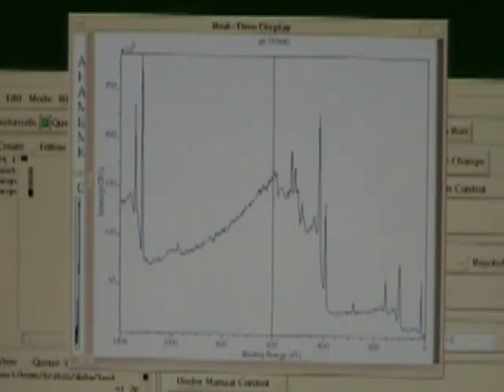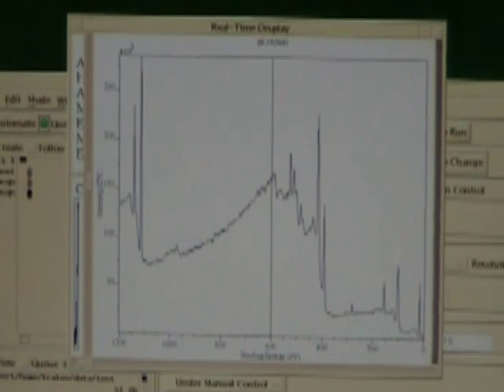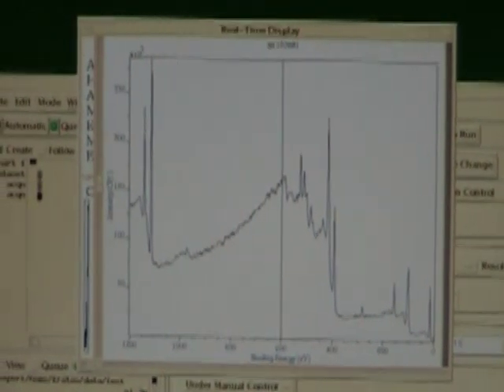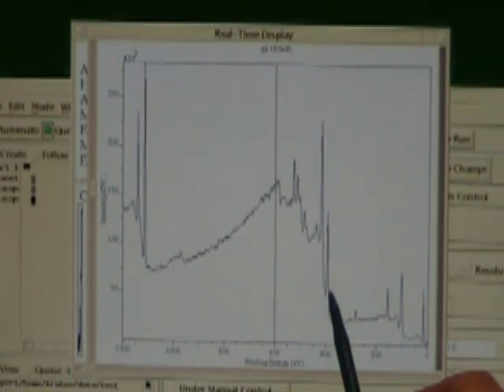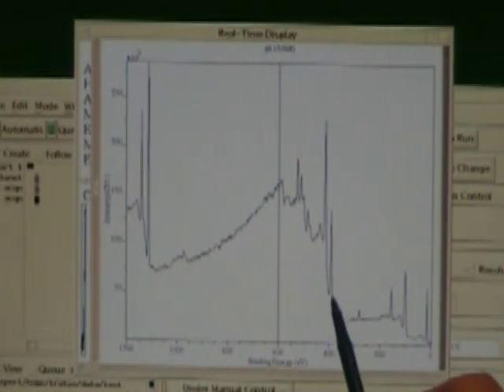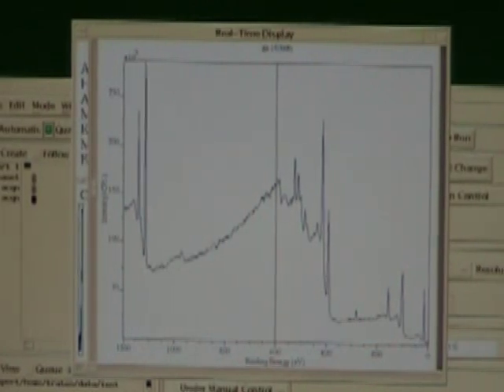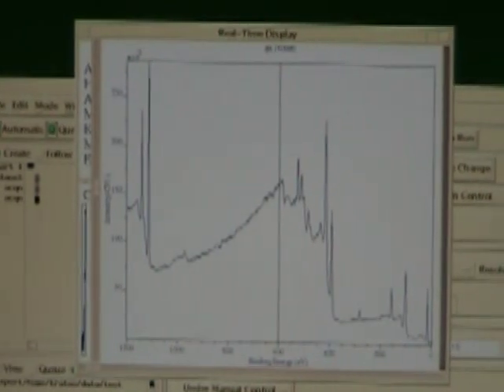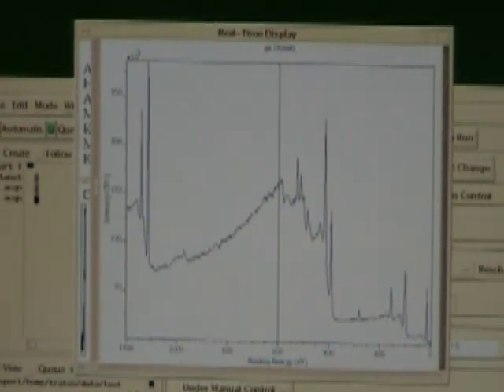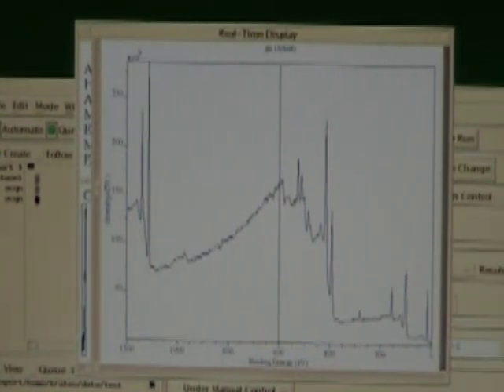We can tell whether the gallium is in one or more bonding states. We'll take a look at this oxygen peak in high resolution and see how much of the oxygen is just sitting on the surface as H2O adsorbed or CO2 as opposed to actually bonded to the gallium. And then this peak here at about 400 eV is actually a combination of the nitrogen 1s photoelectron peak, which is what we're interested in, and the gallium Auger peak, which we're not particularly interested in.